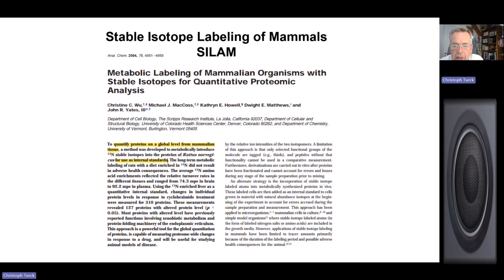Now, originally, this was developed for mass spectrometry purposes for relative quantification. The idea was, just like with cells or smaller organisms, to see if higher organisms, specifically mammalian organisms, were able to incorporate 15N, and the resulting specimens, tissue, plasma, whatever, could be used as a reference material for relative quantification of proteins by mass spectrometry. And it turned out this worked really well.